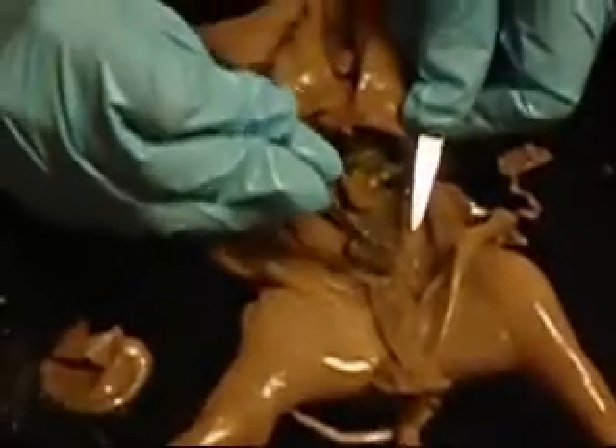The ovaries are found just posterior to the kidneys. The ovaries are connected to the uterine horns, which carry eggs from the ovaries to the uterus. The uterus is dorsal to the urinary bladder. The vagina will actually appear as a continuation of the uterus, and the vagina and urethra open into a common area called the urogenital sinus.